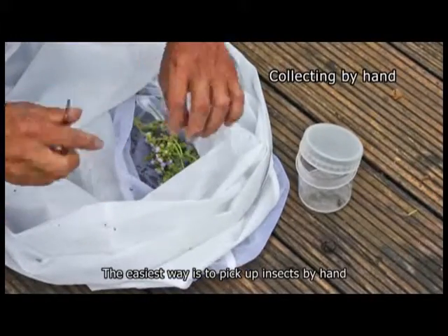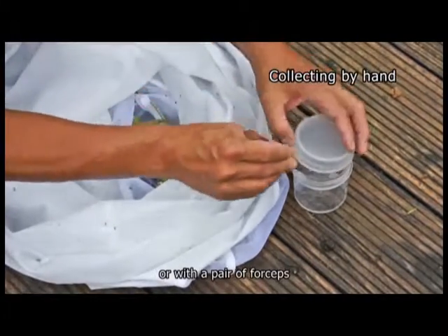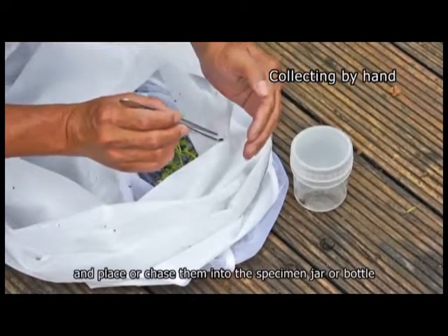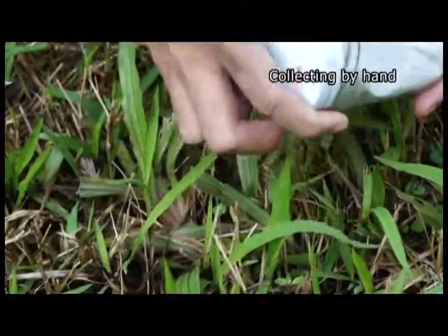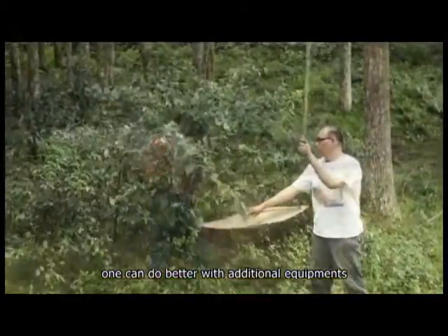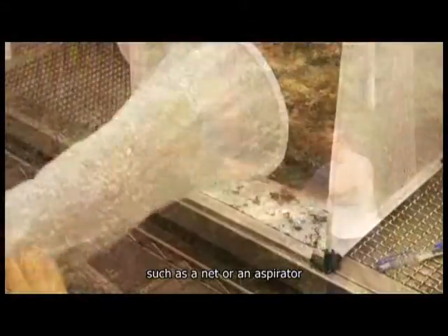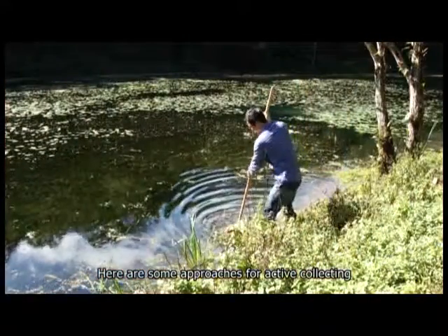The easiest way is to pick up insects by hand or with a pair of forceps, and place or chase them into the specimen jar or bottle. However, one can do better with additional equipment such as a net or an aspirator.